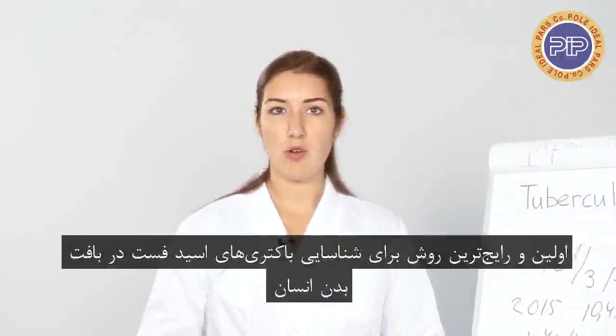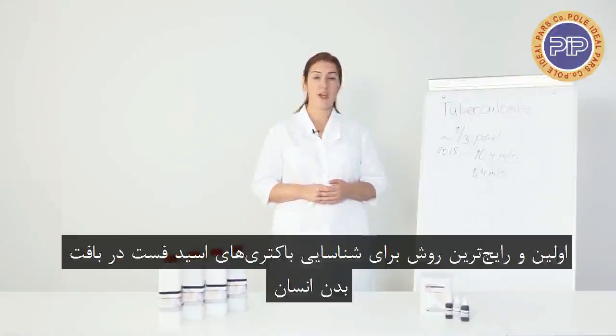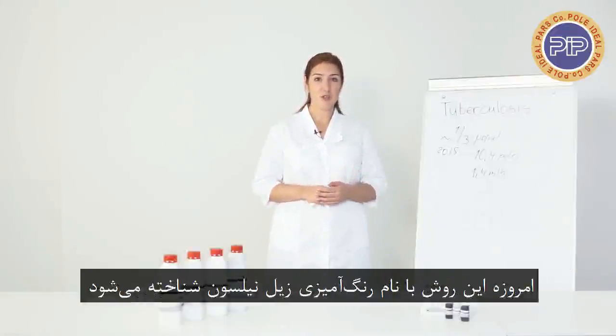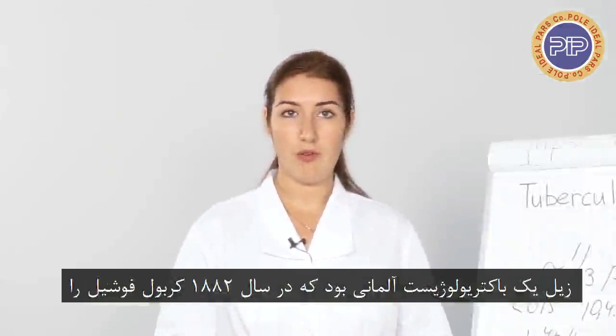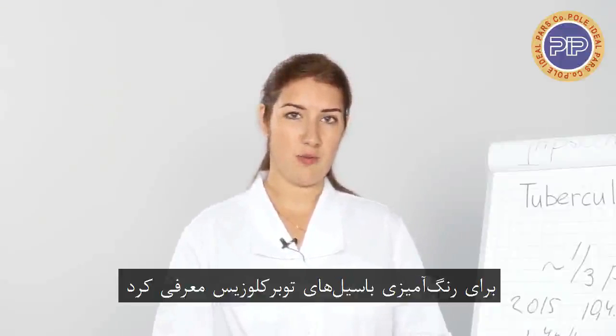The first and most common method to identify acid-fast bacteria in human tissues was introduced by two German doctors, Franz Ziehl and Friedrich Neelsen. Nowadays, it is known as the Ziehl-Neelsen staining. Dr. Franz Ziehl was a German bacteriologist. He introduced carbofuchsin to stain tubercle bacillus in 1882.